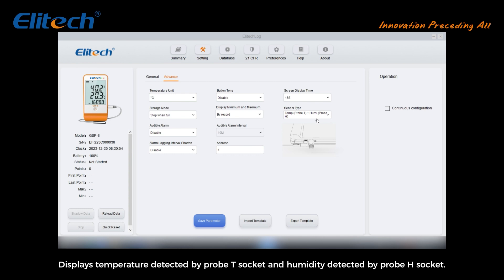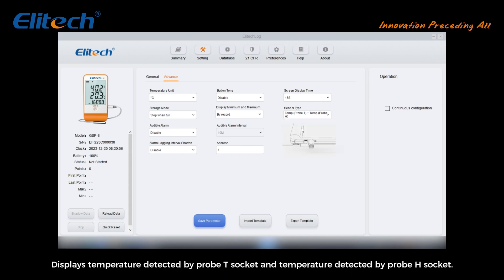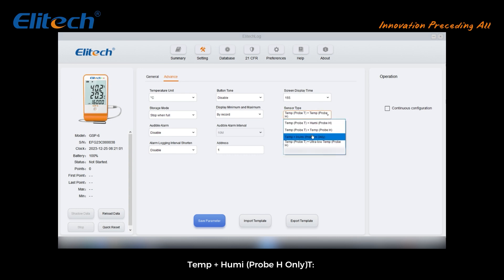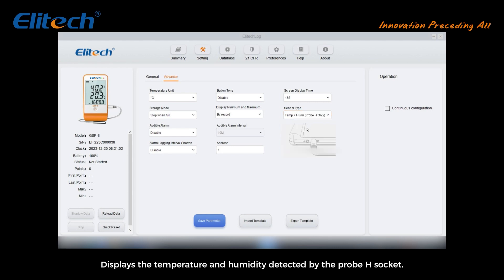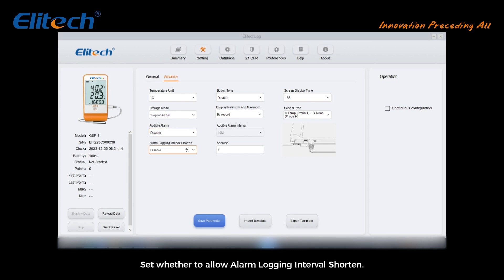Temp Probe T plus Temp Probe H displays temperature detected by Probe T socket and temperature detected by Probe H socket. T plus Humidity Probe H only displays the temperature and humidity detected by the Probe H socket. Set the audible alarm — number of sounds after over-temperature — and set whether to allow alarm logging interval shortening.